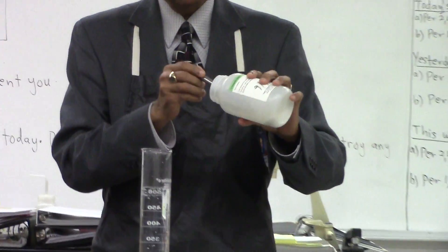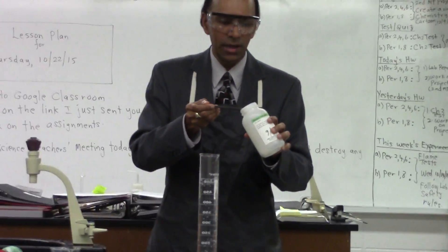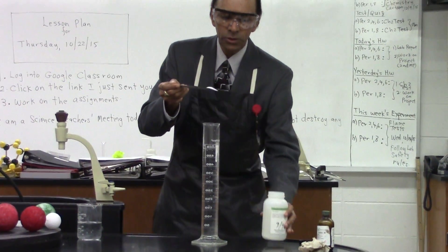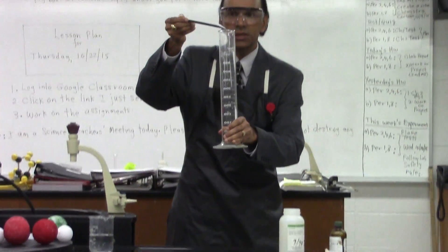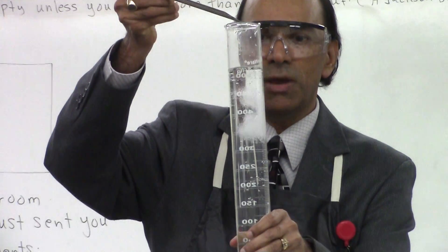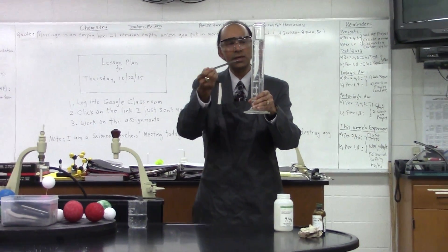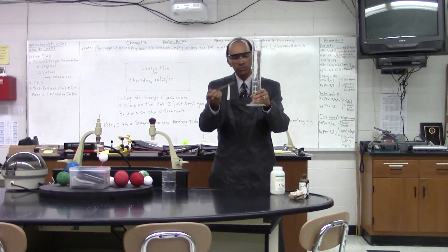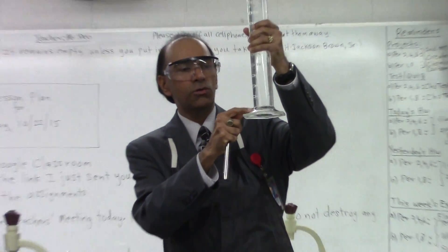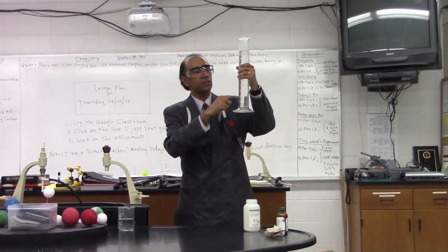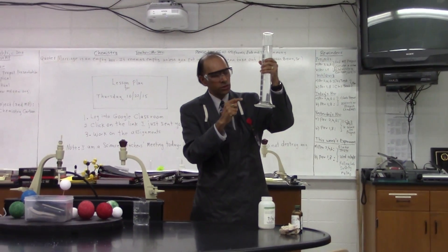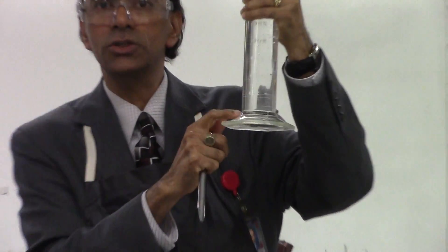I'm now going to put some sodium chloride. The formula for sodium chloride is NaCl, and as I drop the sodium chloride into the water, you can see some of the crystals become suspended, and then they fall to the bottom pretty quickly. But as they're falling to the bottom, the sodium chloride actually dissolves in the water, creating a sodium chloride solution. But if I look at the very bottom, I see some sodium chloride crystals. So what I have right now is not a homogeneous mixture — I have a heterogeneous mixture because I have two different phases: aqueous sodium chloride solution, and at the bottom, some crystals of sodium chloride.